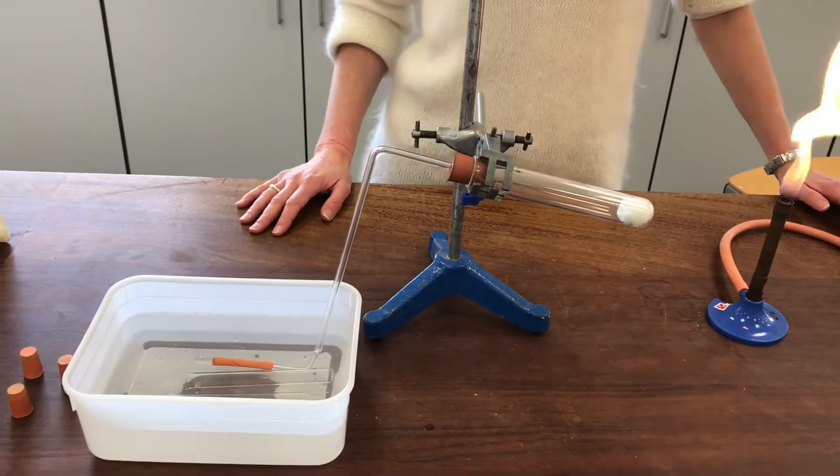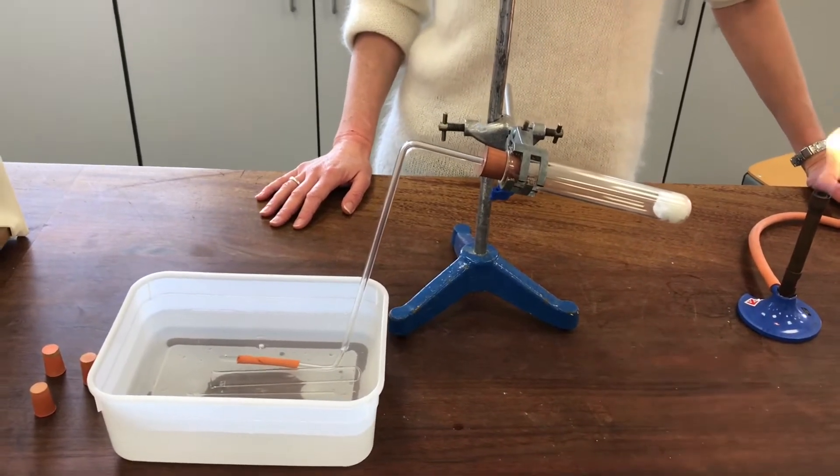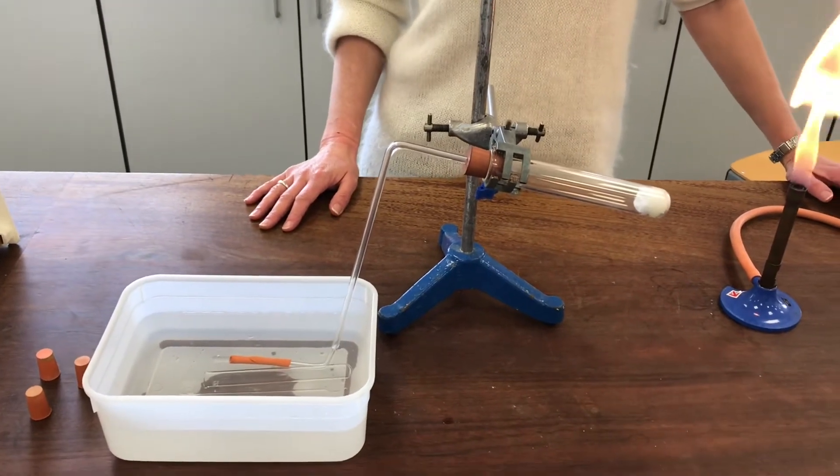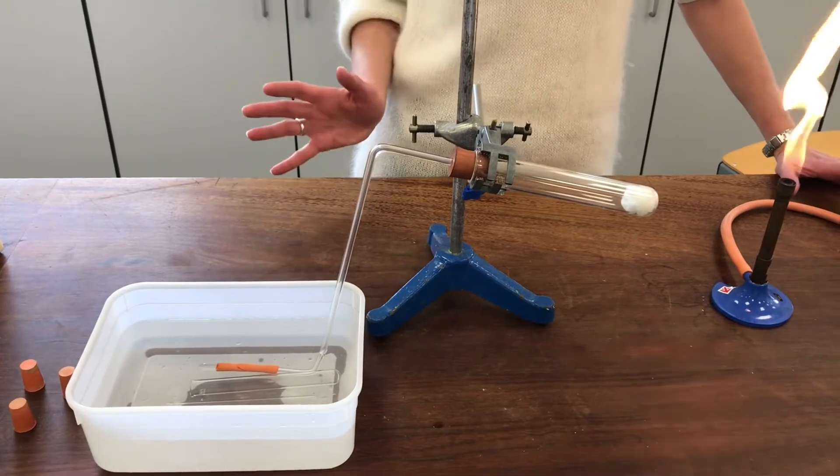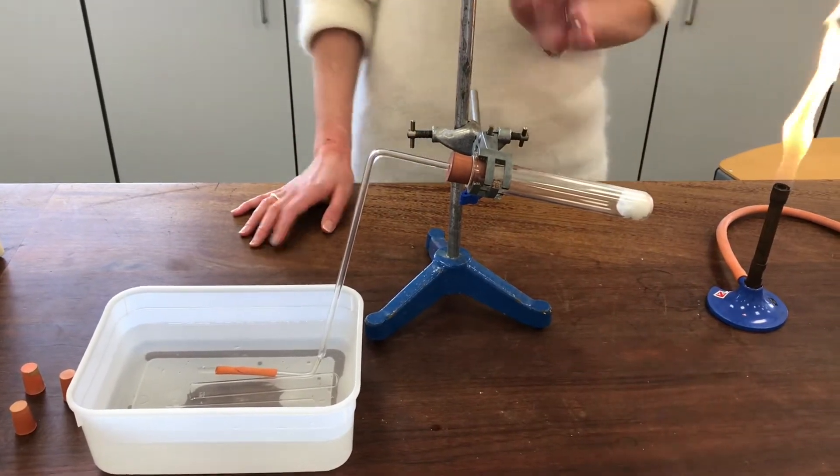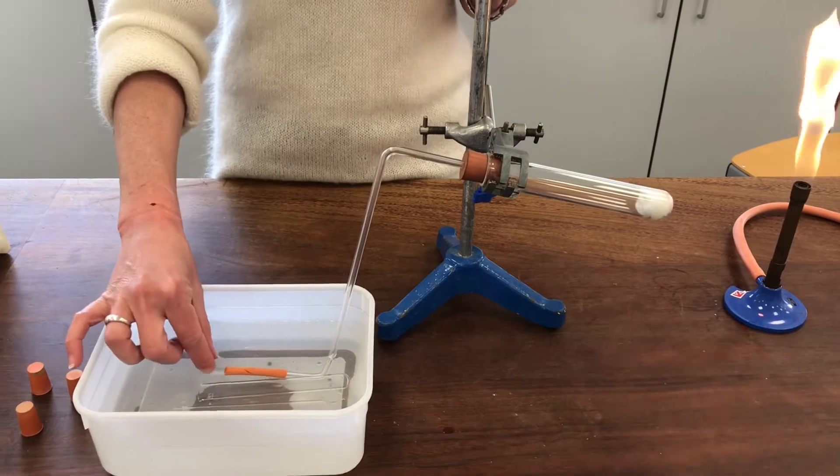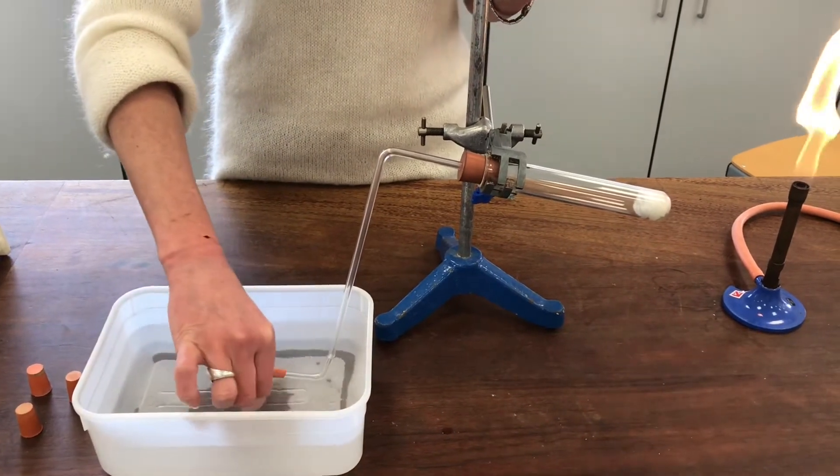Okay, so in this experiment we're going to have a look at what happens when we heat a halogenoalkane with some potassium hydroxide that's been dissolved in ethanol. There's no water in this mixture at all. I'm just going to heat it and I'm expecting a gas is going to form, and I will collect that here by displacement.